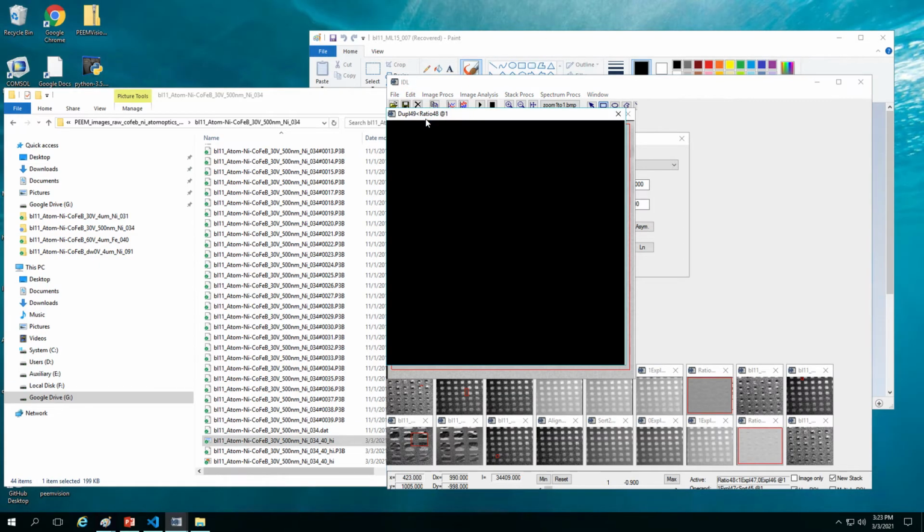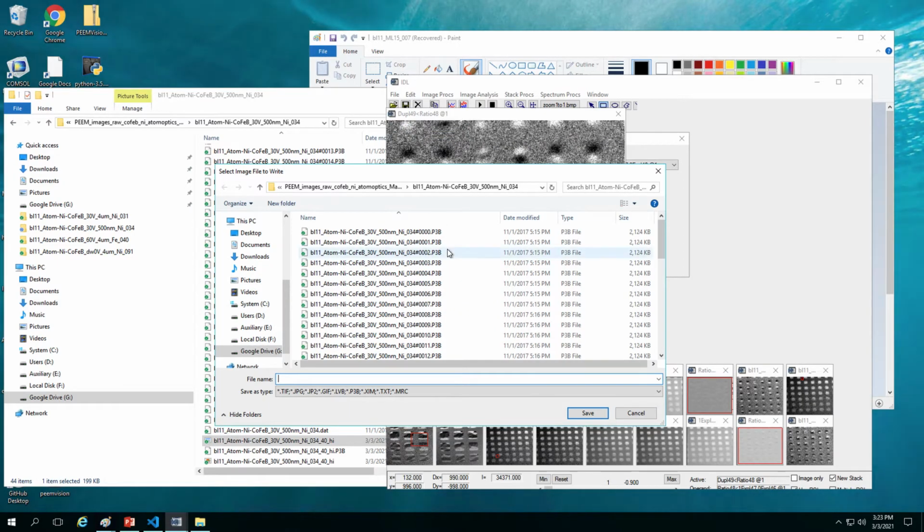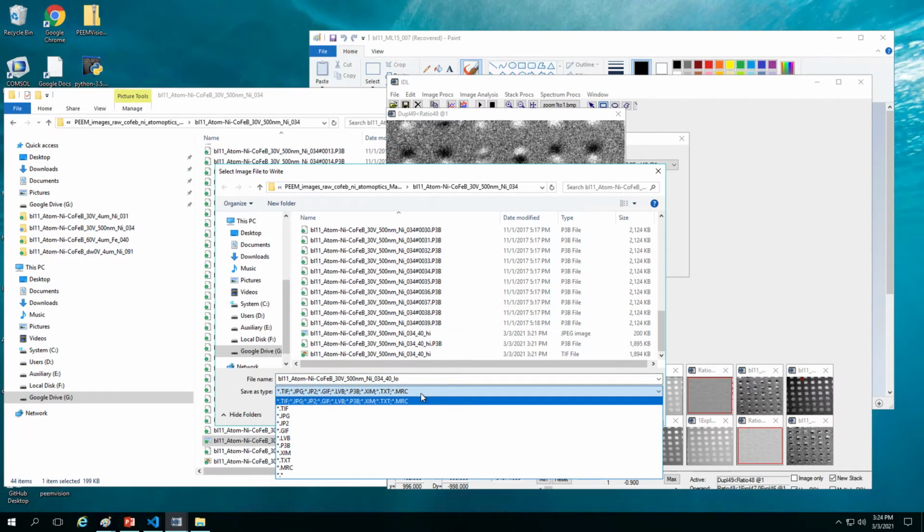Add a duplicate. Okay, so those are our low resolution images, you see. And we will save as, yeah, so that's how it goes. And we will go through all these quickly in a team effort. Hopefully we can progress faster.